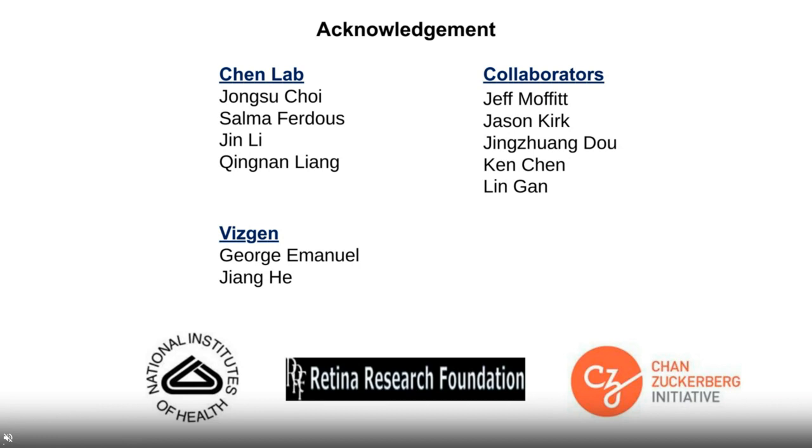Great, thank you. Next question. Would you recommend the cell boundary detection kit in less dense tissue as well? Yes. I can perhaps answer this because this is more related to Vizgen's cell boundary kit. Indeed, for less dense tissues, for example, the central nervous system, like the brain and the spinal cord, there's usually no need for the cell boundary kit because the cell bodies are very separate from each other. For many of those projects that we have seen, they don't need to use the cell boundary staining kit.